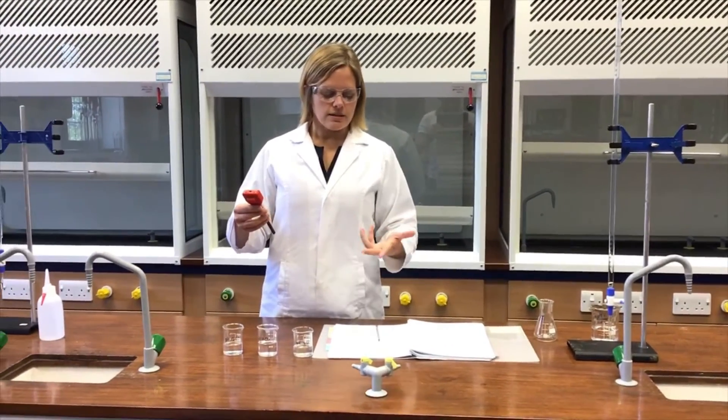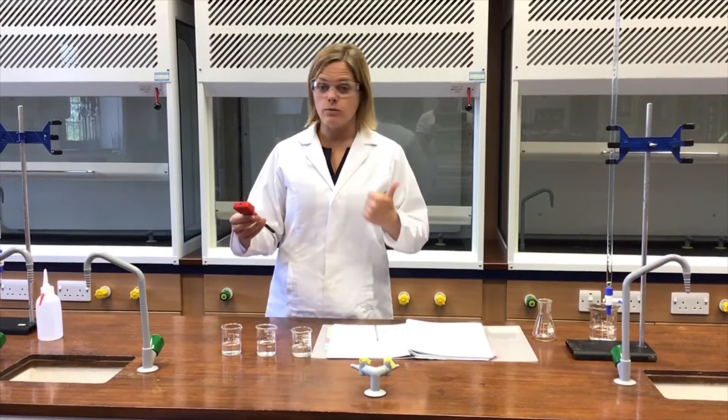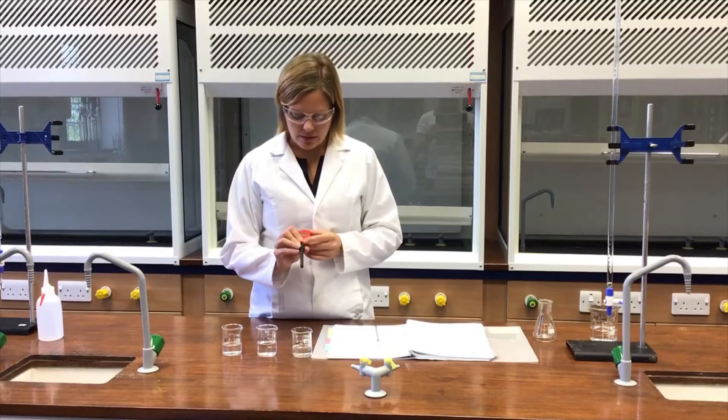Experiment A19, investigating how pH changes when a weak acid reacts with a strong base and when a strong acid reacts with a weak base, makes use of pH meters like this one.